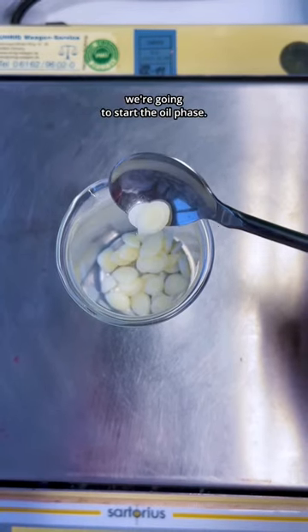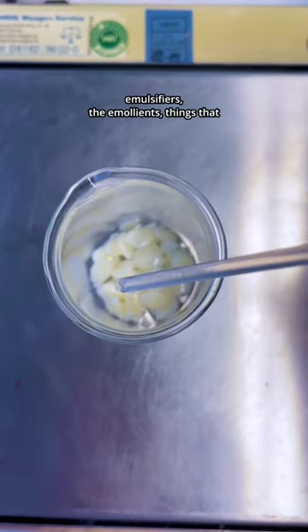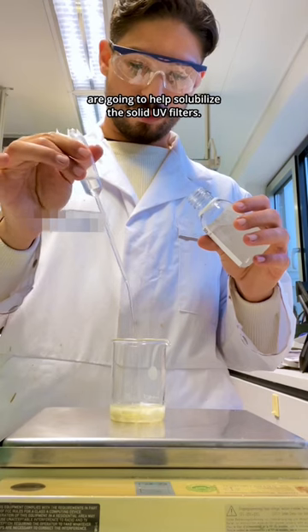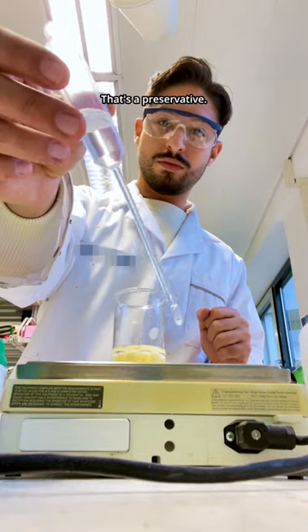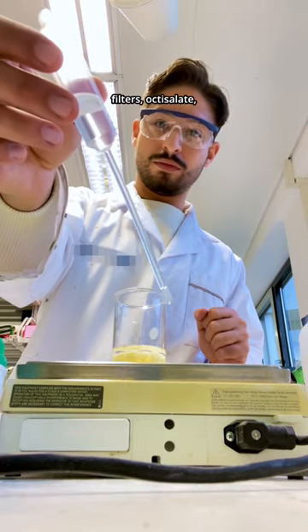While that's doing that, we're going to start the oil phase. This is some of the emulsifiers, the emollients — things that are going to help solubilize the solid UV filters. You see me weighing those out. That's a preservative. And then this is one of the UV filters: octosalate.